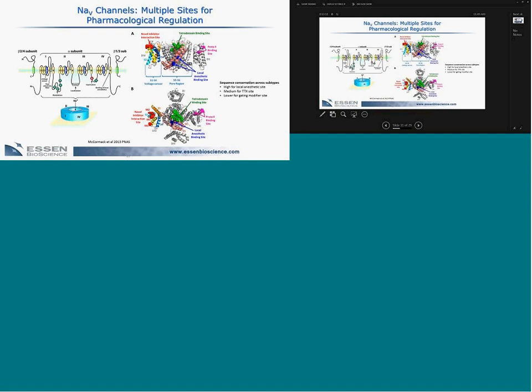So the studies I'm going to talk about use IonWorks electrophysiology as the platform. As you've heard before, it allows you to do both voltage and ligand gated recordings. It's actually quite good for things like hit-to-lead and SAR studies and for safety toxicity studies. And in addition, I think that you can do moderate size HTS campaigns on focused libraries. So it covers a fairly wide range of activities that you might want to do in sodium channel drug discovery. And it also allows you to do a lot of the mechanistic studies and subtype selectivity studies that come in a little bit later on.